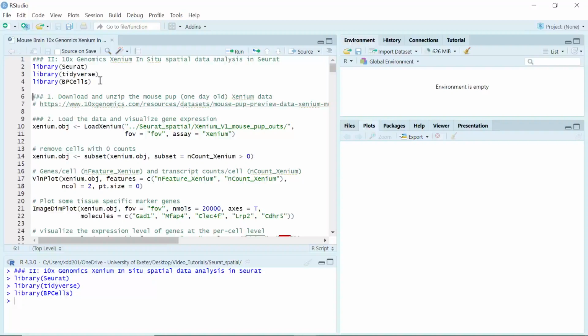Previously, I made a video to show you how to use BPCells and analyze large datasets. I'm not going into details for how to use BPCells today. If you want to know more details, you can watch that video.